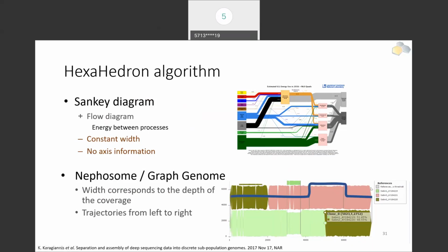Here you can see that this is a potential path. There's another path. This is another path as well. And this is not, because the middle part here is generated from the lower, and the rightmost part here is generated from the upper. So this is not really a way to follow this trajectory.